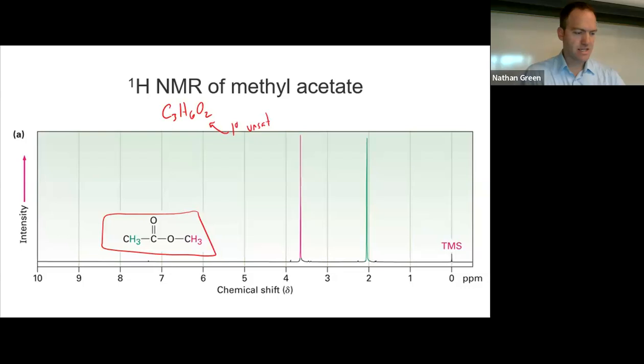I have 2 peaks here, and hopefully they show up for you the same color here, kind of red and green. Is this showing up well enough in here? Then you turn off more lights so that those protons are green and those protons are red. You see that? And if I turn off one more set of lights, you're going to fall asleep on me. I'll try and make it extra exciting. Any better? Okay. I think for the Zoom folks, now it's getting really dark. And I look like I'm telling ghost stories now. You guys can see. And then next, the proton, just when you thought you were safe.